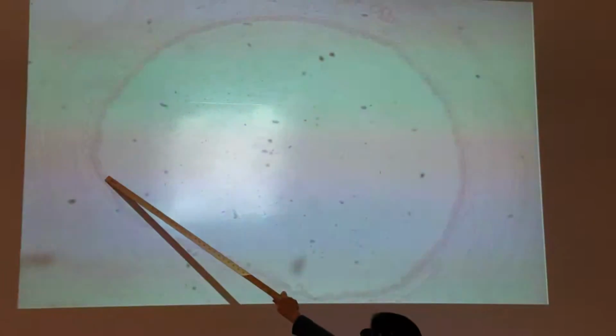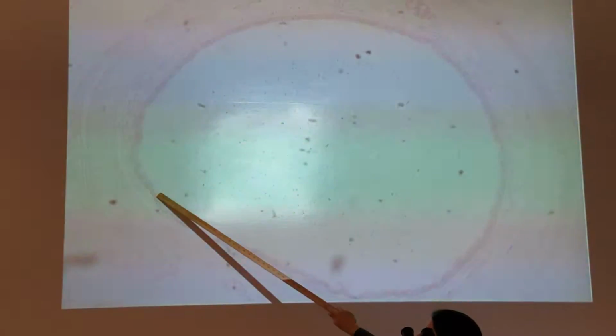So we've got a few structures on here to go through. If we work our way out from the lumen, so here's the lumen here, our first layer of epithelium is going to be the, what is this layer? Is that the pseudostratified ciliated columnar epithelium, also known as PSCCE? So all of this that lines the lumen, PSCCE.